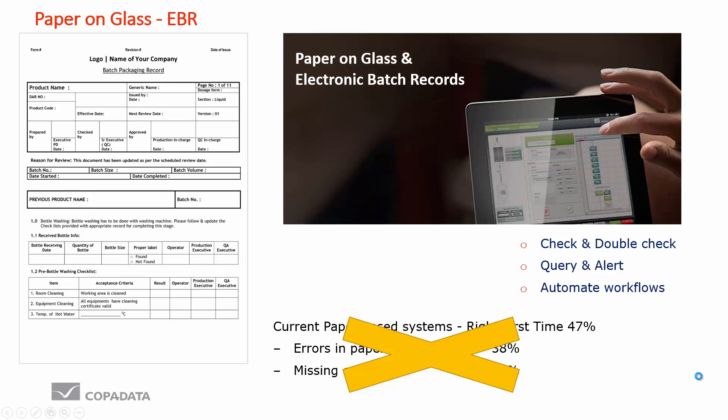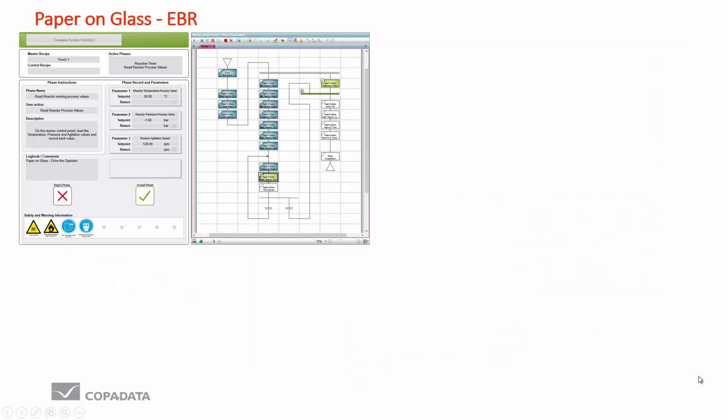So what does this look like? Here is an example screen of the paper on glass application. On the right hand side is our batch control module, an ISA-88 batch engine which in this instance is not driving the physical process. It is instructing the operator of certain tasks to carry out and to record certain information back into the system. We can see it gives a very visual context of how the production is supposed to flow.